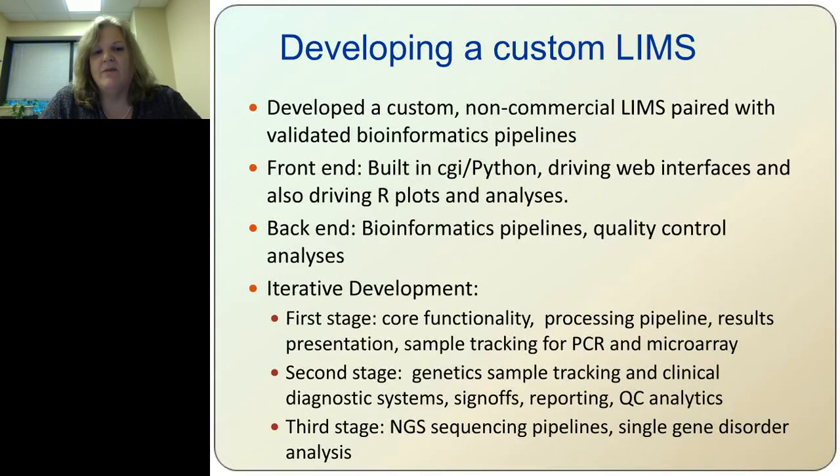For us, we decided to develop a custom LIMS. And part of my job is to enable research here at RMA, New Jersey, by creating systems that make it very easy for research to go as smoothly as possible. And I found that a lot of the commercial software we looked at would also require a bit of programming, basically, or wrapper writing. There's no out-of-the-box perfect LIMS system for PGD, especially for a group like ours where we do a lot of data validation, method validation, and then put it into production as a clinical laboratory.